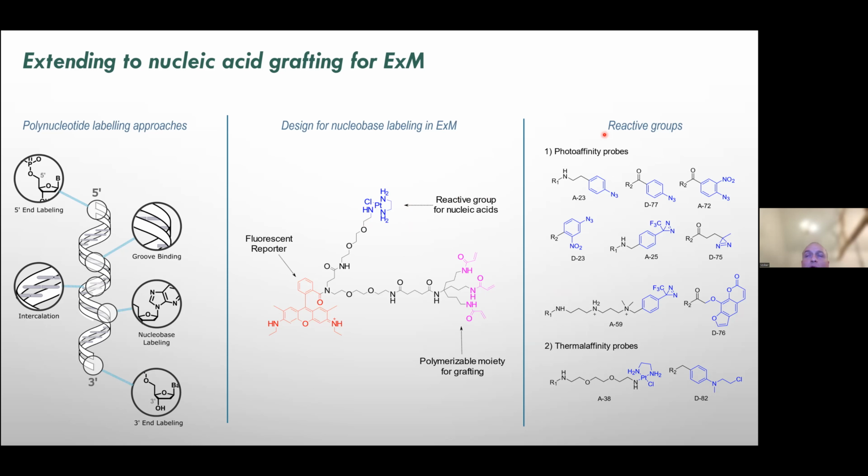We've looked at probes that can be activated by light or by heating. As you, for example, see here, this platinum complex as seen before, or a nitrogen mustard. What you see here is a psoralen ligand, which also works very nicely, and some other light activated linkers.